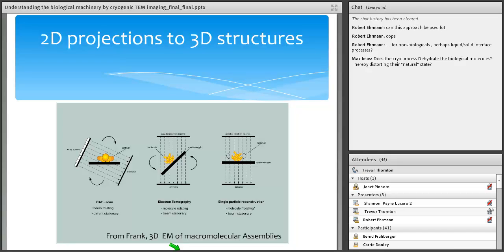For the biological material in the electron microscope, we have two options. We can't rotate an electron microscope because they don't do well in rotation. So instead of rotating the microscope, we'll rotate the biological material relative to the electron beam. It seems better to do that. Yeah, but there's a problem with that: eventually the table the biological material sits on, we call that the electron microscope grid, gets in the way.